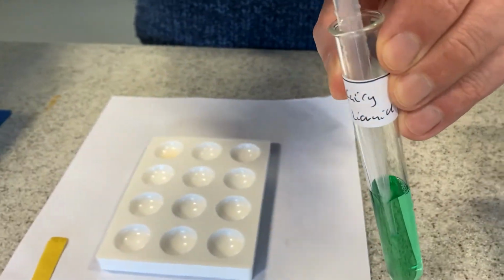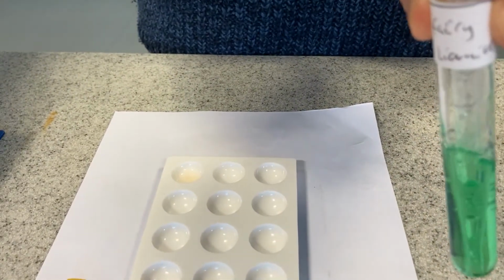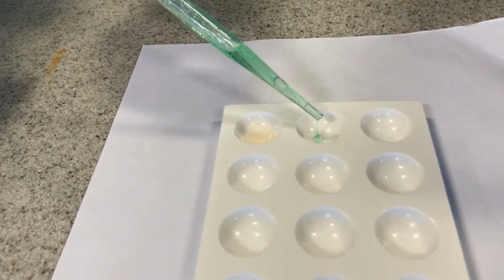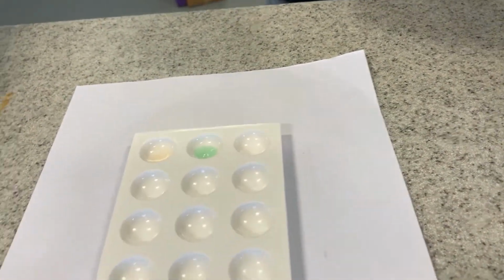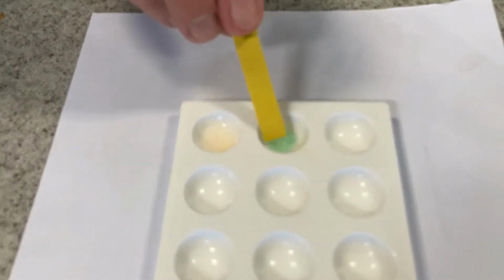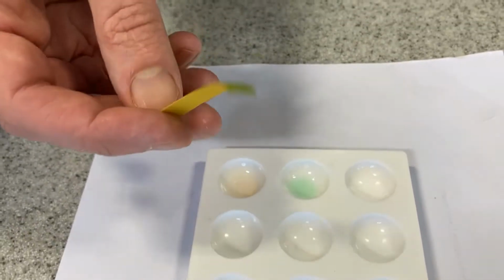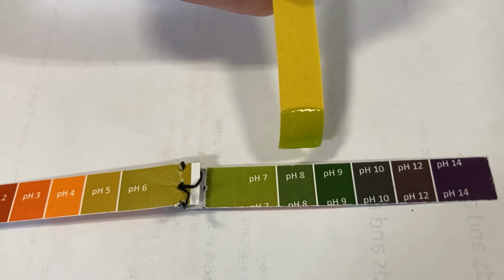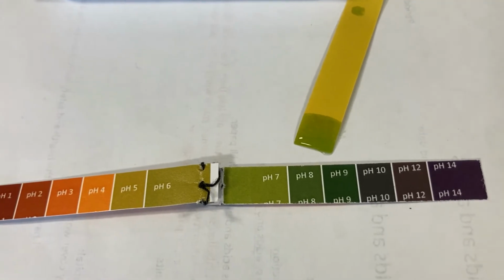And let's put the washing up liquid in this pipette. A bit harder to suck this one up. Right, let's put a bit of fairy liquid in there. I think that's roughly 4. Now then, will that be an acid, an alkali, or neutral? We shall see. It's a little bit hard to get it, but it's gone to this sort of colour here. It's maybe pH 8. It's a very, very weak alkali. Very weak alkali there for the fairy liquid.